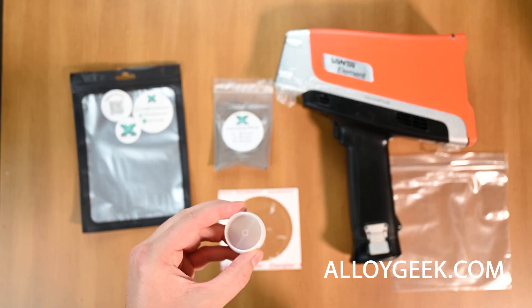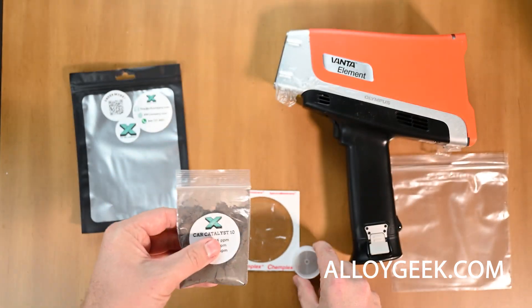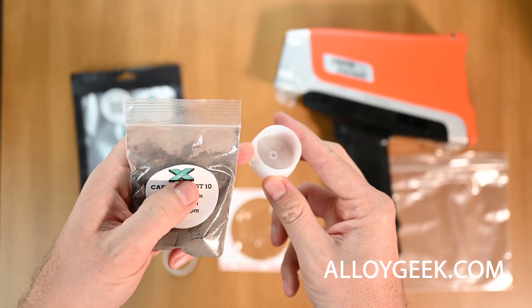This includes a sample cup, which is a closed bottom cup that looks like this one. We're going to need to take our catalytic converter material and put that inside the cup.